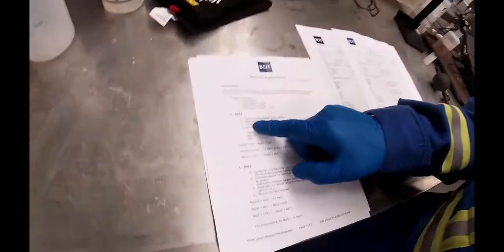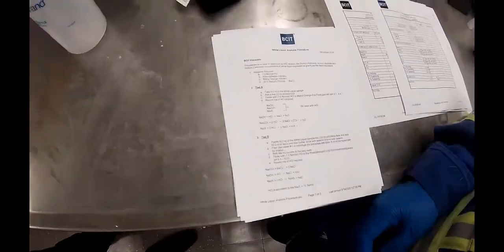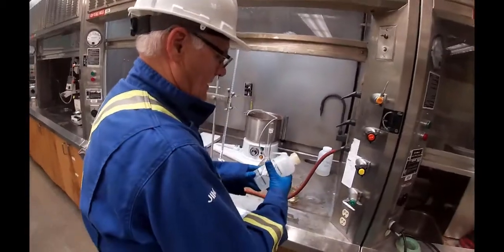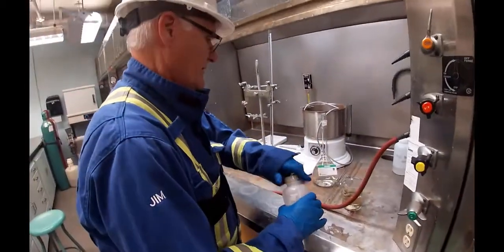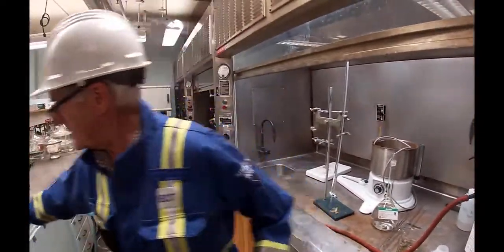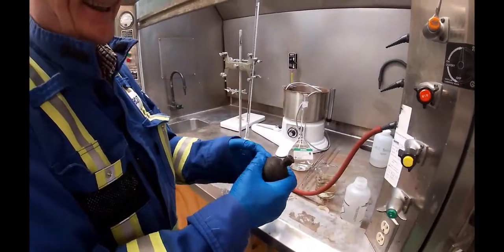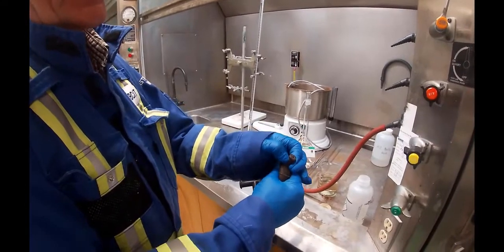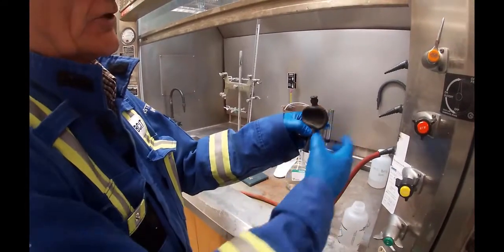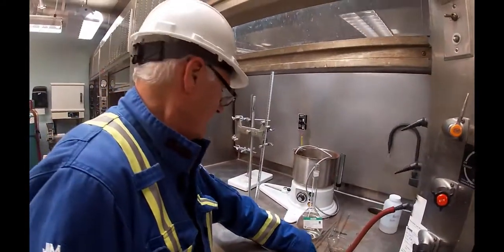So we're actually going to take 5 milliliters of white liquor sample, add a couple of drops of water, and I usually like to use 2 mils. So this is deionized water, and squeegee, there it is. This little bulb is quite complicated. There's valves all over it, so I just push one of them to vent the air out, and now you can see it's ready to suck, and when you push on this one, it actually will pull air up in here.